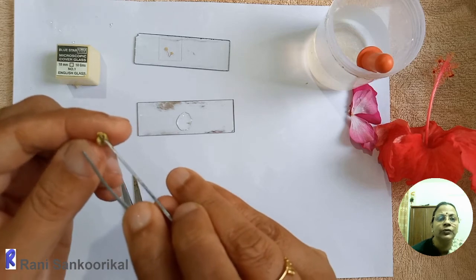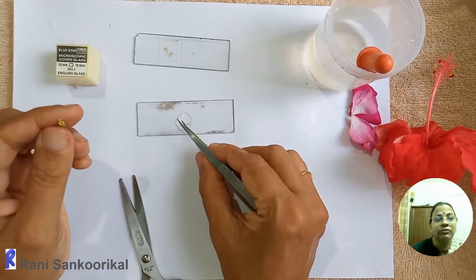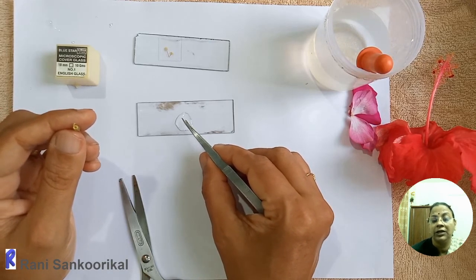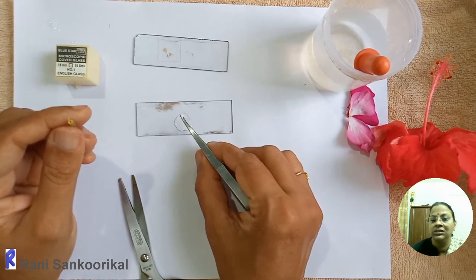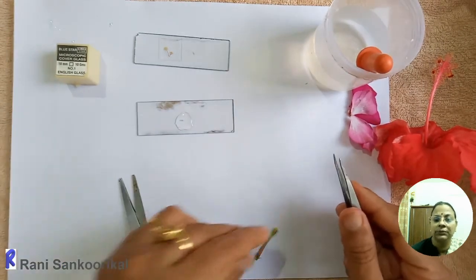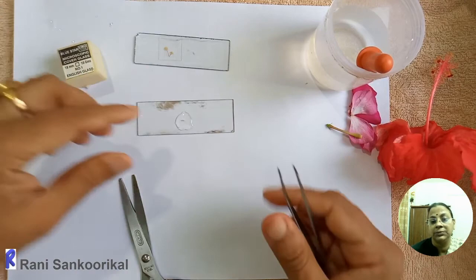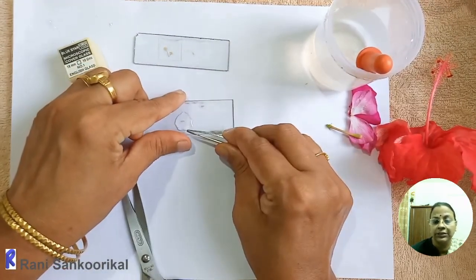It is very minute only, but even then germination will be very fast or very easily can be detected in vinca. In hibiscus, the germination frequency is very, very slow and it will not germinate much. Whereas vinca means it very easily will germinate. So practical, when you are getting a chance to do in the lab, it is better to use vinca instead of hibiscus.